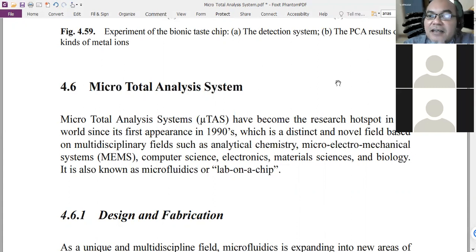Which one, sir? Diana and who? Elnora already also learned how to use it. So you use a digital cutter. Because the digital wax printer is expensive, what we do is you make the pattern using paper, and then you impregnate the paper using wax. And then the wax is transferred from the paper into the fabric using a laminating machine.